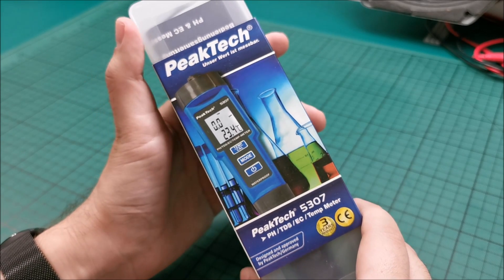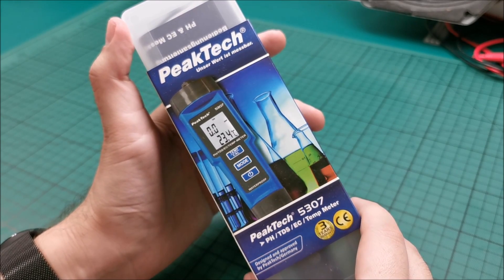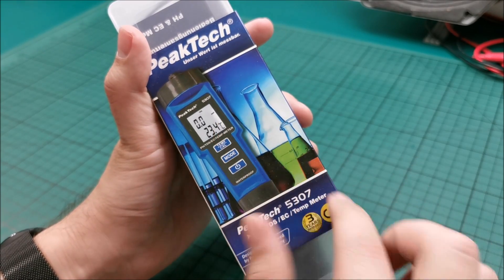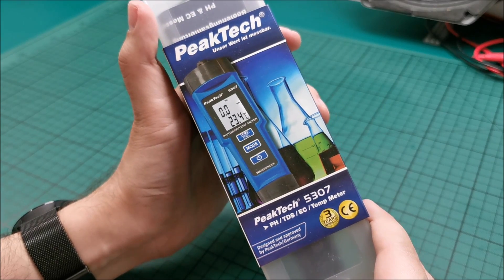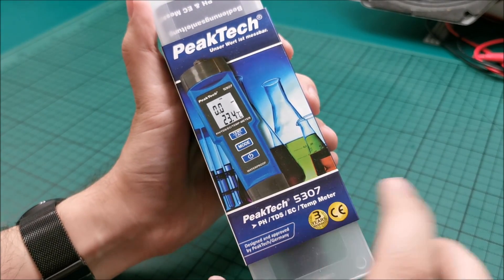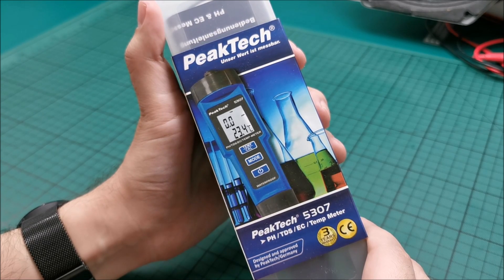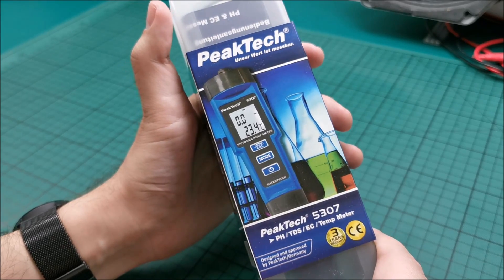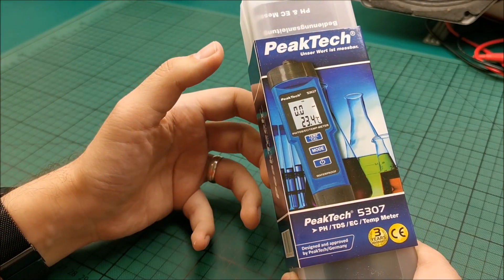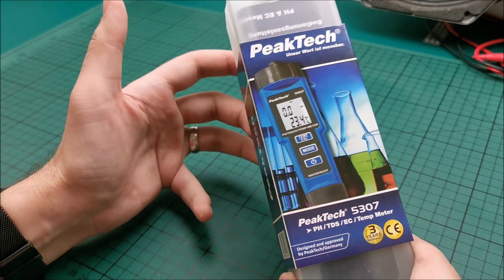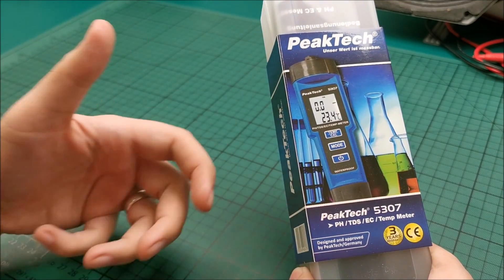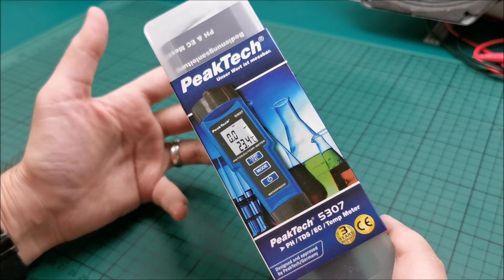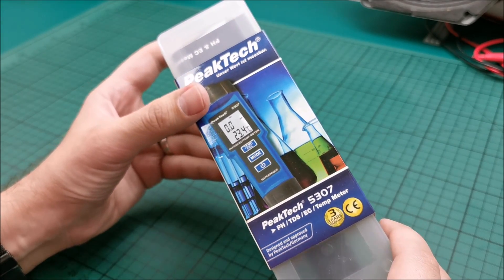And another reason, I want to see if soil can be tested with this. I want to see why some plants didn't really like to grow in the garden. Is the pH actually wrong on the soil? Because it's not enough just to throw in fertilizer without checking some stuff. So you just put more and more manure for example and hope for the best. It kind of doesn't work like that. It could be too much at a certain point in time. So pH does need to be tested from time to time.